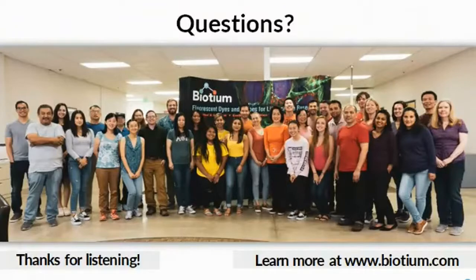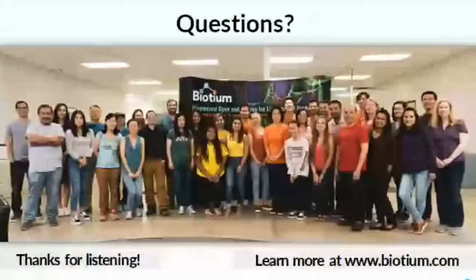No, as I mentioned, you can directly use them. Most people are used to using ethidium bromide, where they would add the dye to the gel, and you can use both gel red and gel green in that way. You can also perform post staining, as in, run your gel first and then stain it. And only for gel red, we have another option where you can mix it with your sample. So, there is no change to how you would be using these dyes. You can use it as a pre-stain mixed with your sample. Instead of just mixing it with loading buffer, we provide loading buffer which has the gel red dye. And so you could just mix it and run your sample without needing to then stain it.